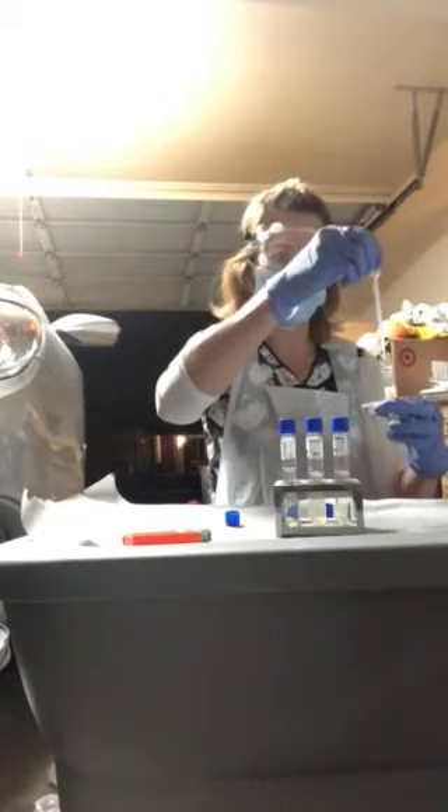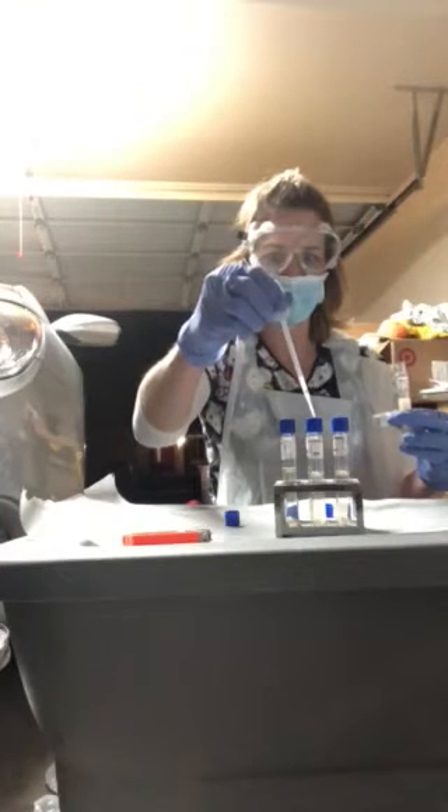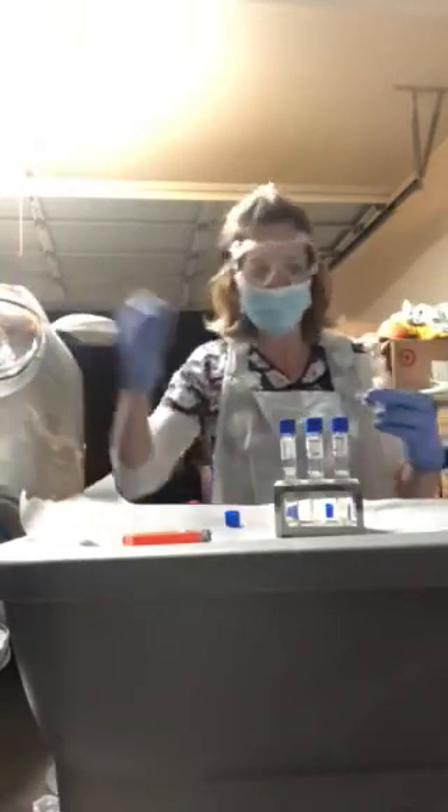I'm going to do two drops each: one, two; one, two; one, two. Then I'll put my pipette in my bleach bucket.